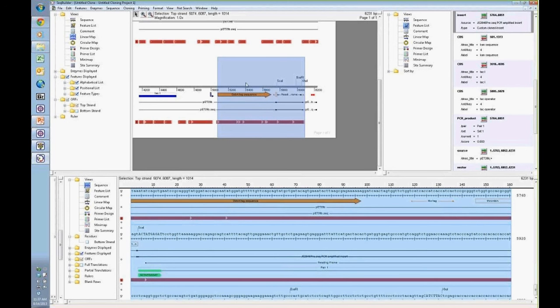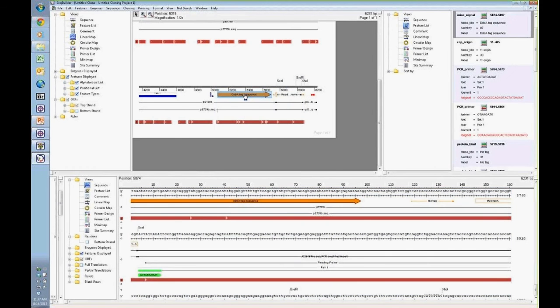Sure. Everything that you see here, you can manipulate. We've changed how this visualization is being shown, but you can also change specific elements or features that exist in the representation. Like I said previously, these are all annotations that previously existed in the file that I brought down from NCBI, or the pET-39b plasmid that I've already brought into the software. So these have already been added.